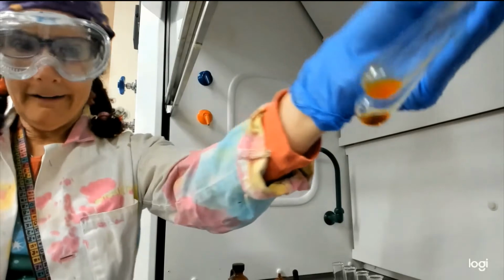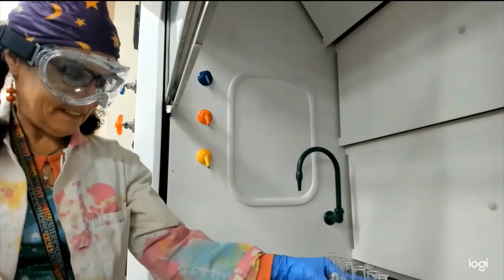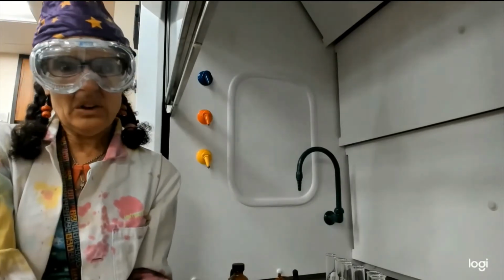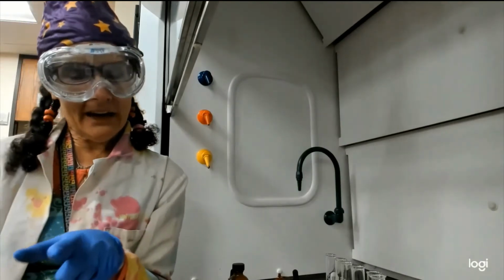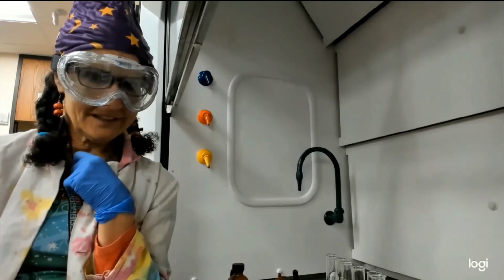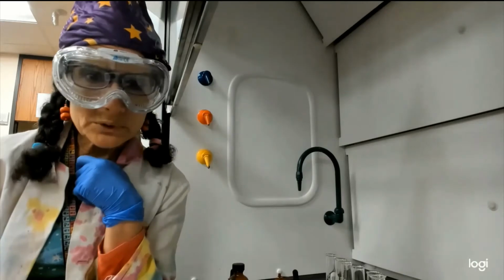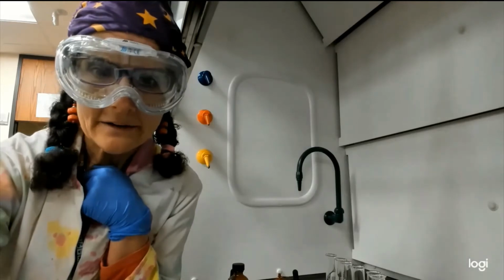So what you write for your notes next to the butanol, it just stayed, I can say orange and clear, and sorry, for the alcohol. For the aldehyde, you'd say orange, cloudy, precipitate. So next to the aldehyde, now pretending like we don't know what it is. And if we have an unknown, we test it. We figure out what it is. Perhaps we should do that. Perhaps we'll put you on pause and go find an unknown. Hold on, I'll be right back.